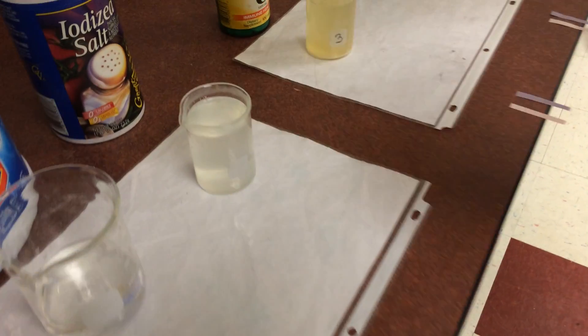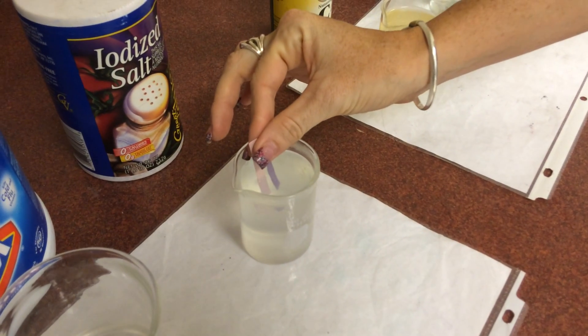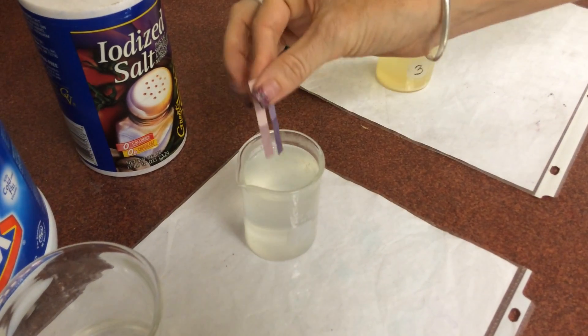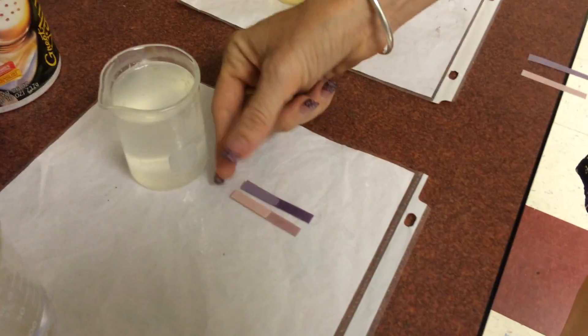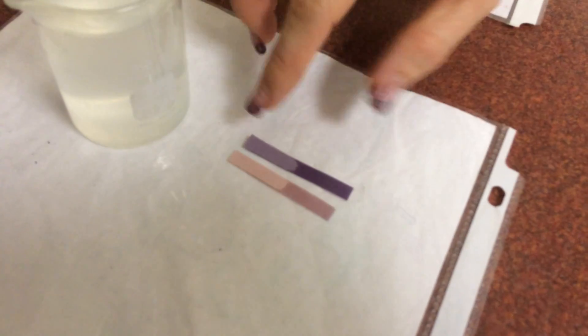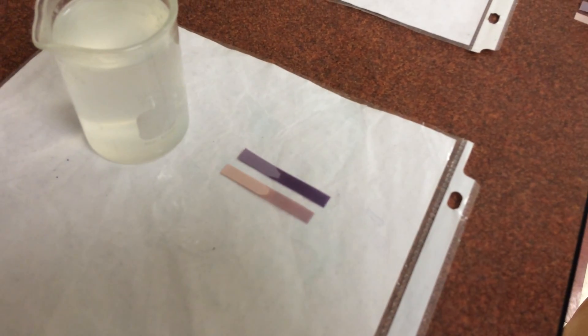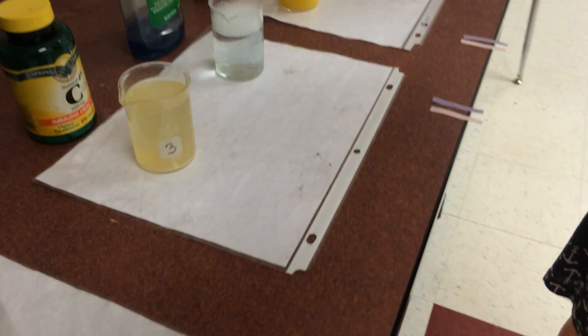Salt water here. We got some salt mixed into water, because we can't test pH if it's not in solution. If we dip this in here, it appears that our pink maybe turned just ever so slightly blue, and our blue stayed blue. So salt water might be very, very, very weak on the side of a base.